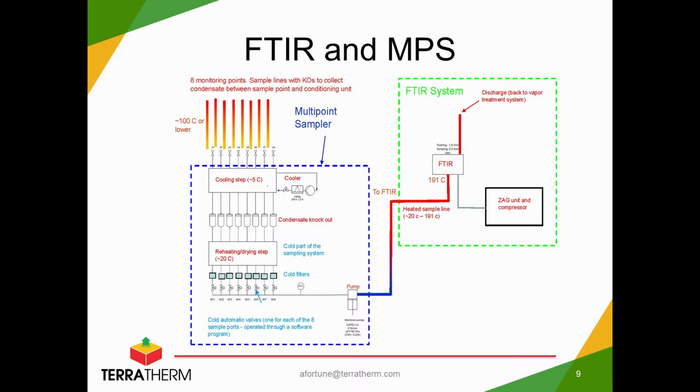After the highest concentration, we had an extended flushing period to make sure that the system was baselined out again. And the system was actually very stable and was able to flush out. We really didn't have any problems with any type of cross-contamination during the course of the project.